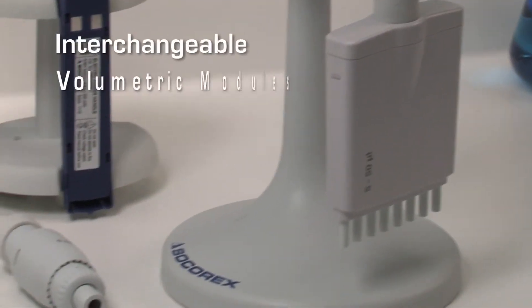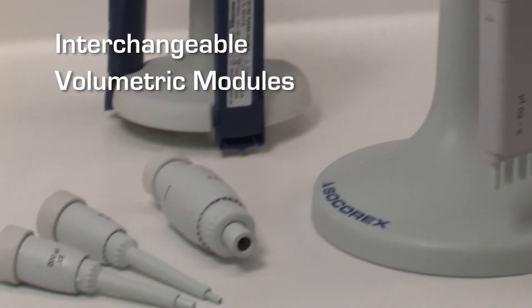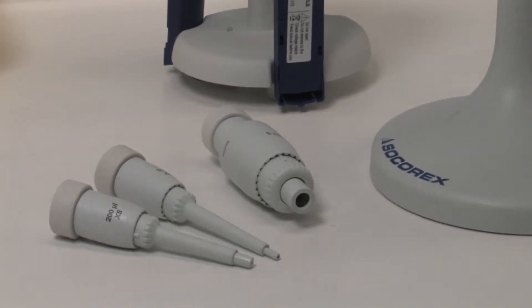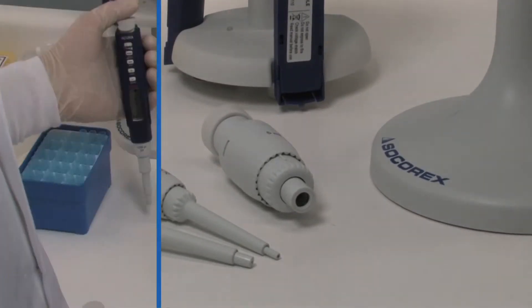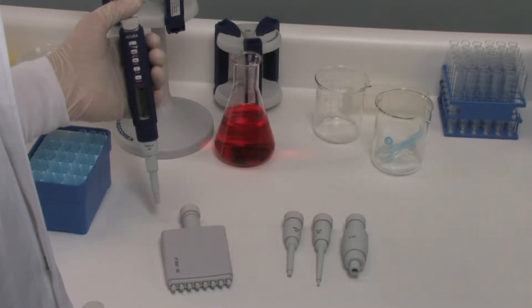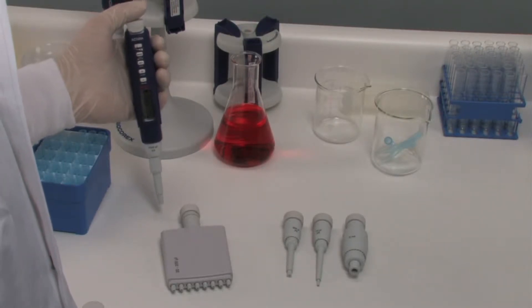One control unit offers a choice of 27 volumetric assemblies, all available separately. This greatly extends working possibilities and makes electronic pipetting affordable for all budgets. Changing the volumetric assembly can be easily completed by the user at any time. Disassembling and reassembling without any tools contributes towards maximum flexibility.